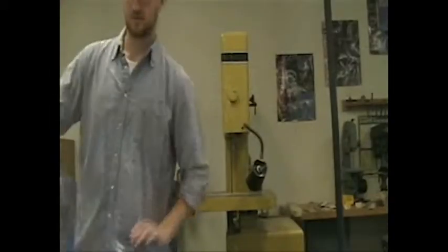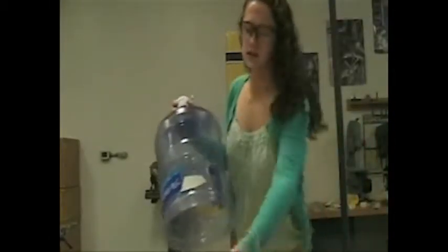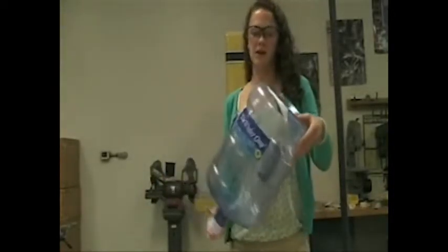Right now we're labeling the water jugs and the lids that he just cut so that we have the right lid to each container. It'll allow for a better seal and the correct lid.